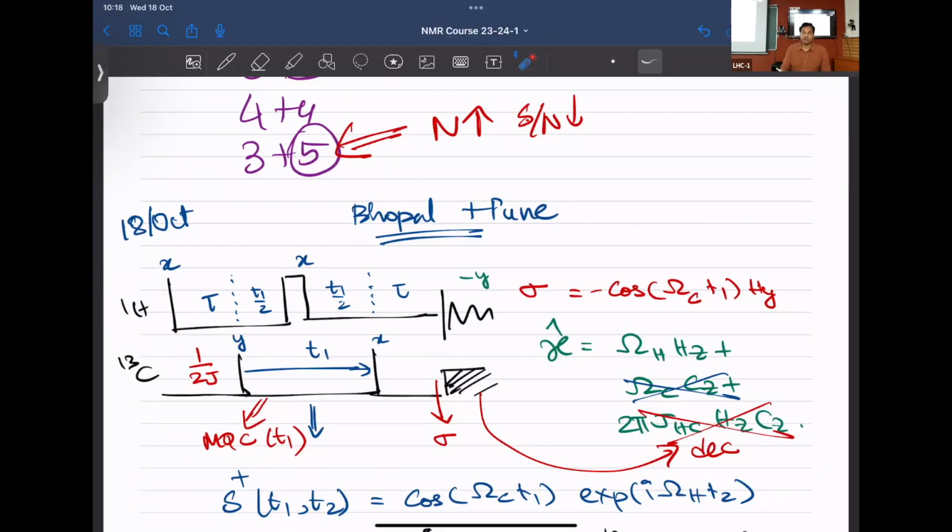True? So therefore, if your T1s are vastly different, anything that has a long proton T1 will have a lower intensity because it wouldn't have recovered as much in the D1 delay, unless you do short pulsing with steady state scans and carefully tune this flip angle. There are other ways to surmount it, but I'm just giving you some ideas where it would once again be weighted on the proton T1s.